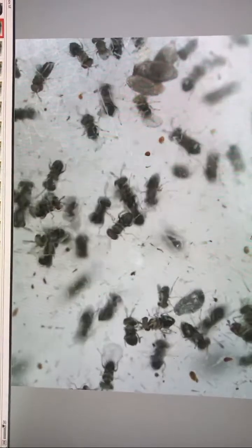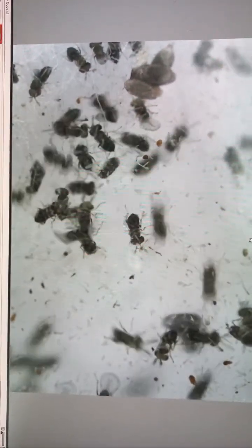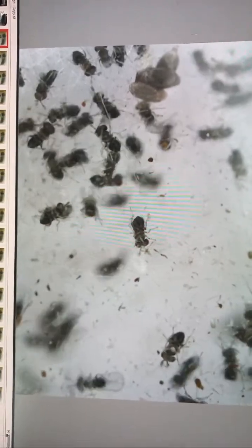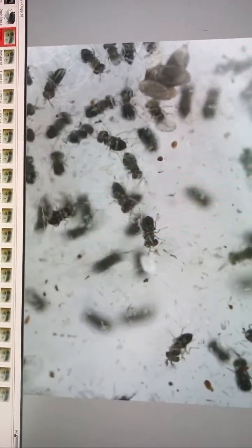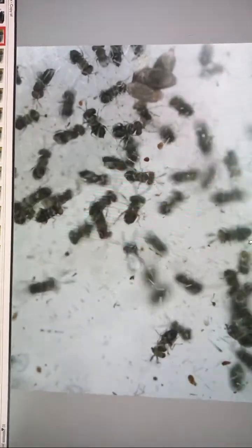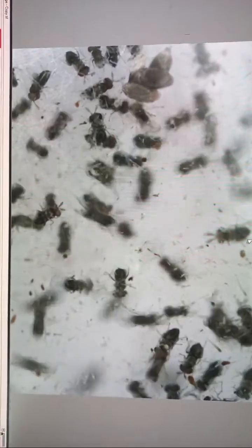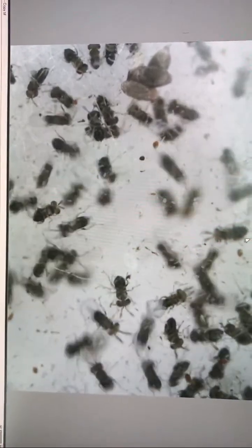In the central part you can see females, 2 females. We just stopped a little. When we are crowding very quickly, we cannot take photo because this is not slow-mo, this is just online translation, immediately from under the microscope directly to you.